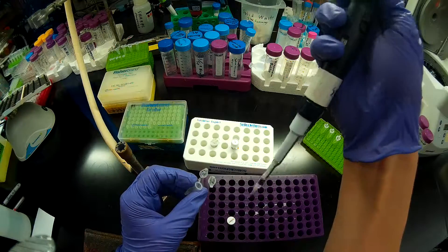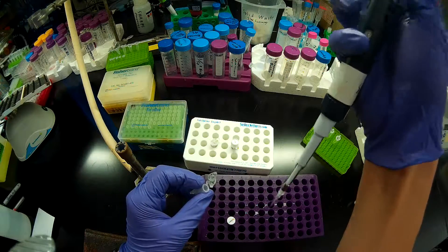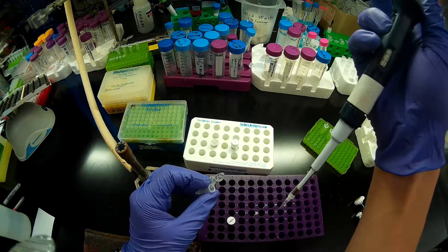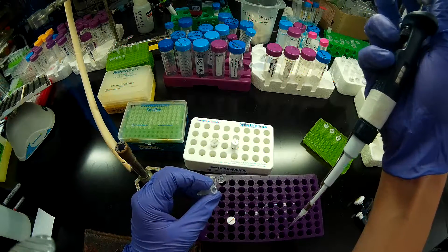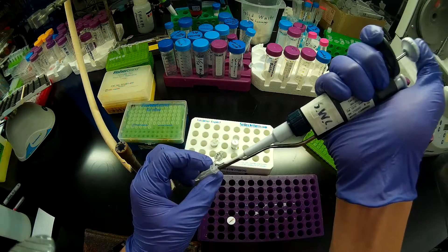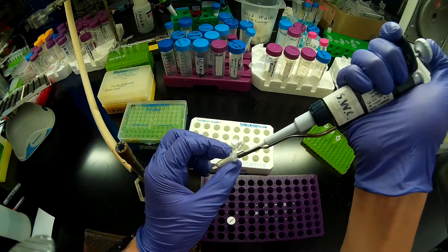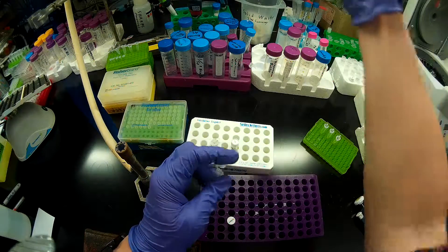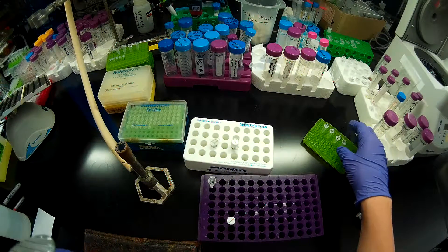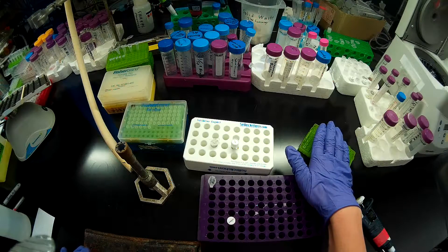I want to mix this by pipetting. Then this will be ready to put in a 37-degree incubator along with the rest of my digests. I happen to know that it's going to be a 37-degree reaction for all of these enzymes.